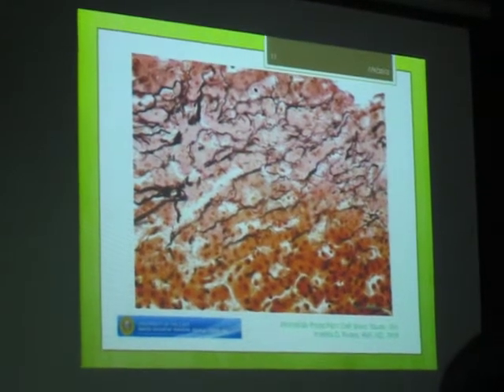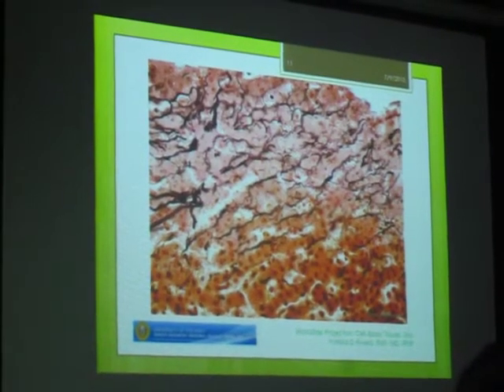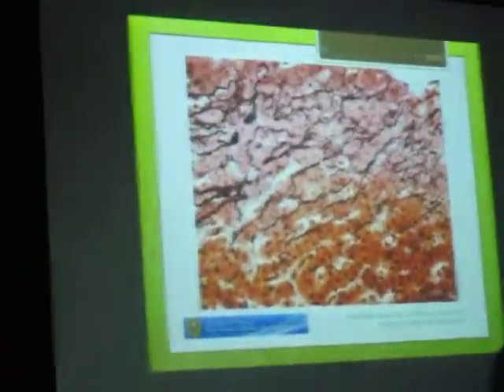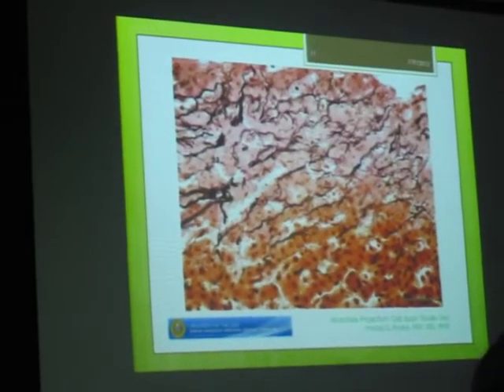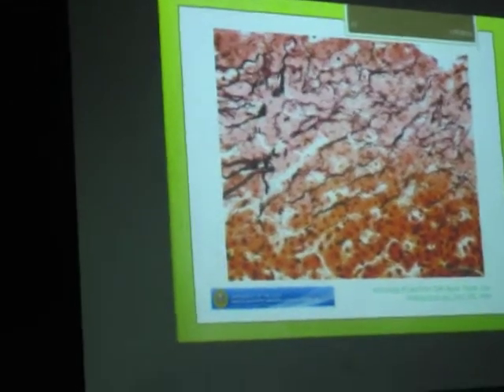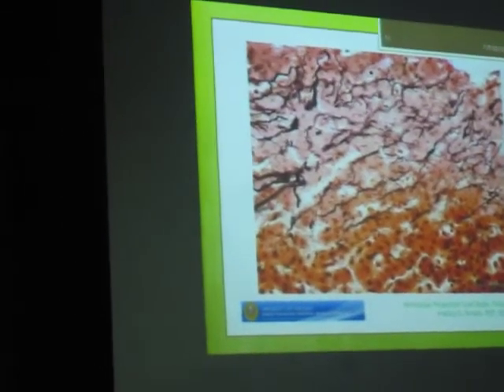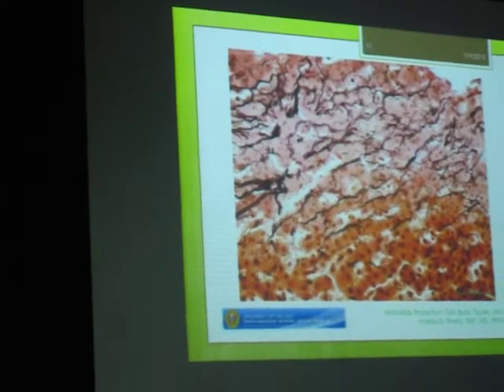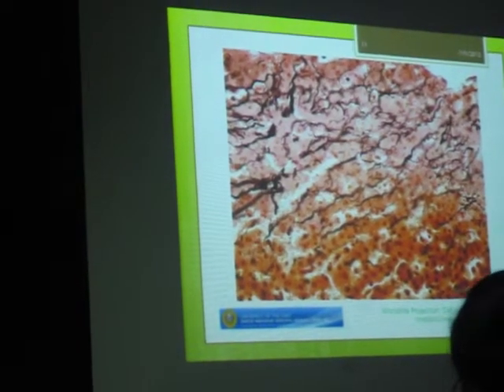If the question is classify the pointed tissue, reticular tissue, which is a special type of connective tissue. Okay? So be careful in reading the questions. Do not hurry reading the questions. And you read the questions first before looking at the specimen.